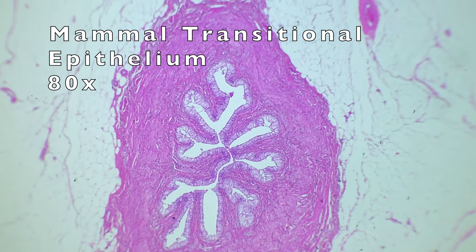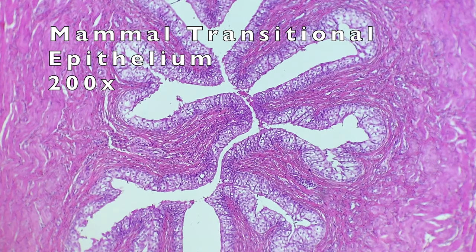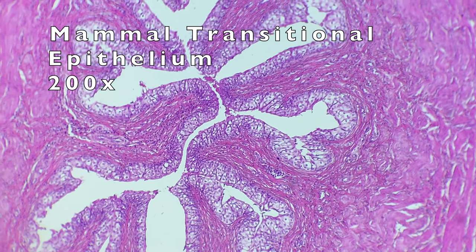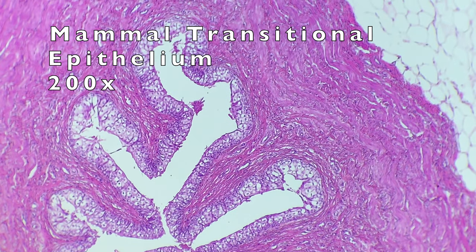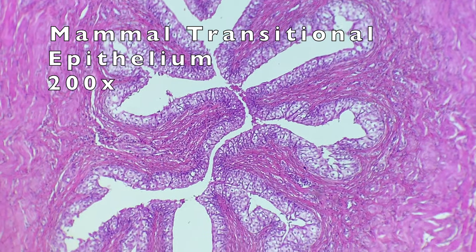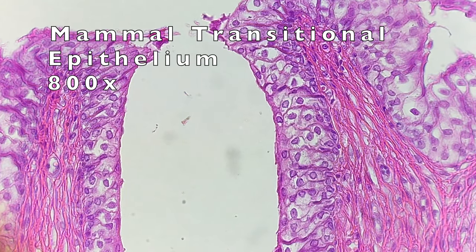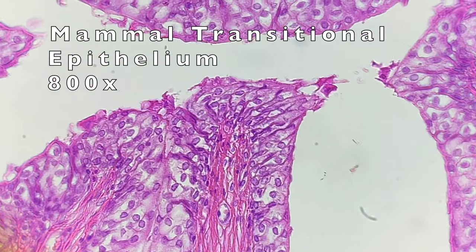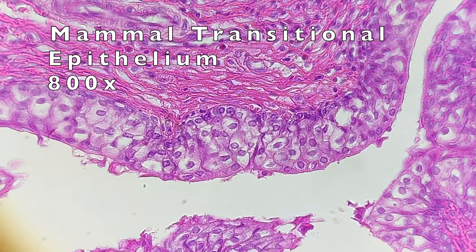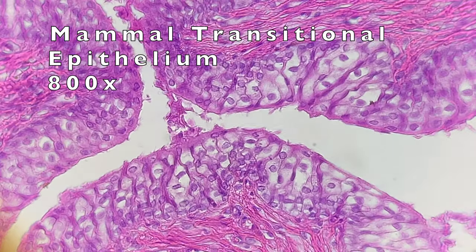Now this is transitional epithelium, which makes up the center part here — where we have different types of epithelial cells, squamous and cuboidal, mixed together. This kind of tissue is not very common throughout the body. What I believe we are looking at here is the bladder of some sort of animal. What leads me to think it is the bladder is the fact that this empty cavity has many twists and turns, clearly set up in a way that would allow it to expand — and that's what the bladder does: it contracts greatly when empty, then expands.